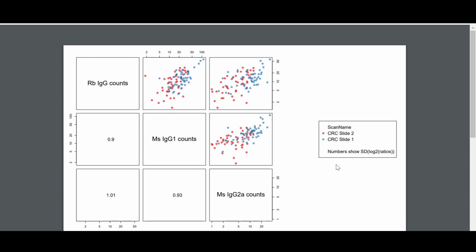At first, the concept of background counts needing to be high enough may seem counterintuitive, because we tend to think of a lower background as better for an experiment. However, for normalization, we need our counts high enough to have a degree of stability. An easy way to internalize this concept is to consider a low negative IgG count value for a given AOI.